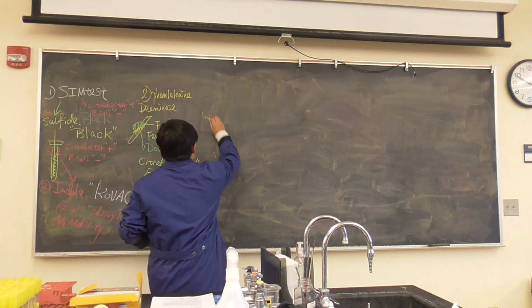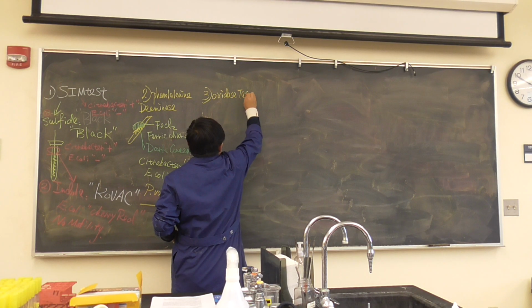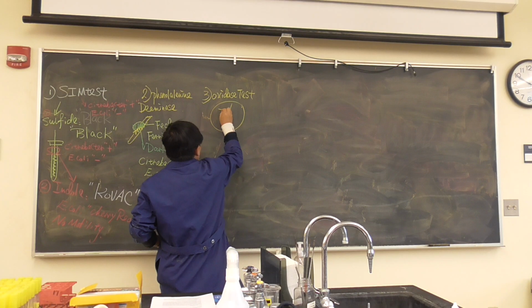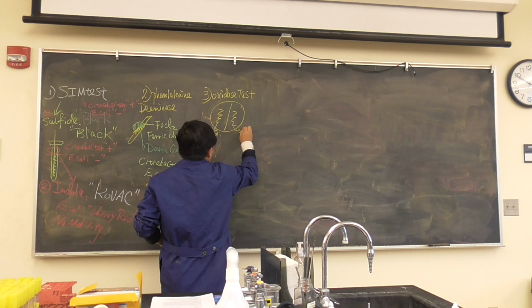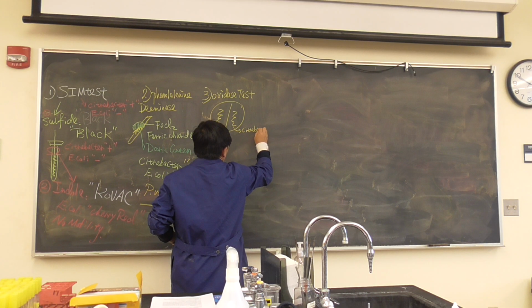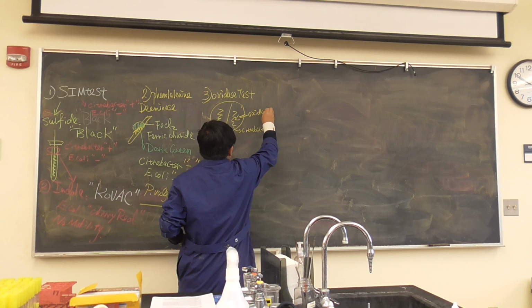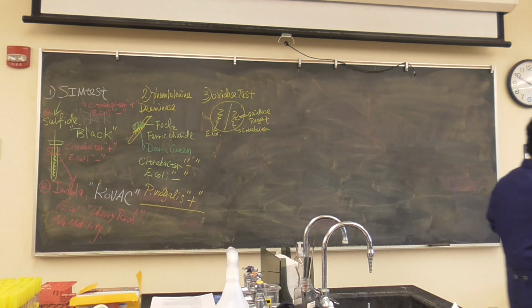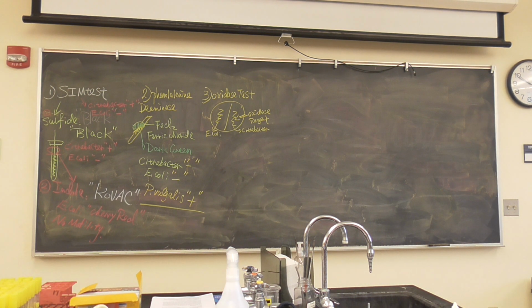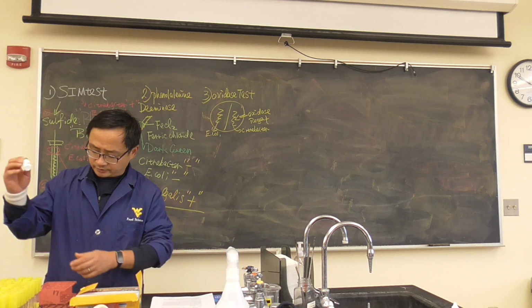Okay? Number 3, oxidase test. So how we did it? We add E. coli, we add Citrobacter. Okay, we're gonna dump in the oxidase reagent. So let's see what it looks like. Who has a plate? Well, I'll borrow yours to see whether this works. So oxidase reagent, we are going to have an oxidase reagent right here.